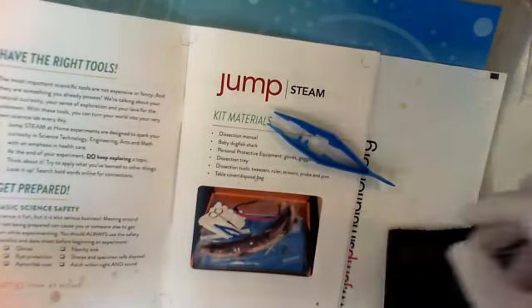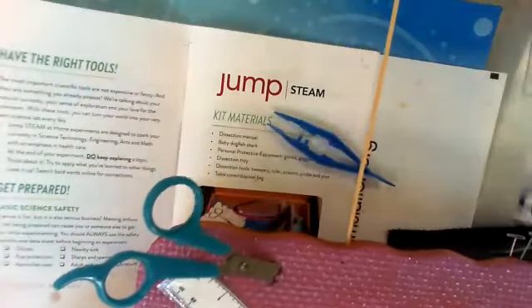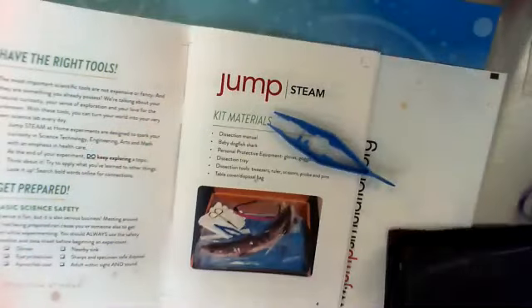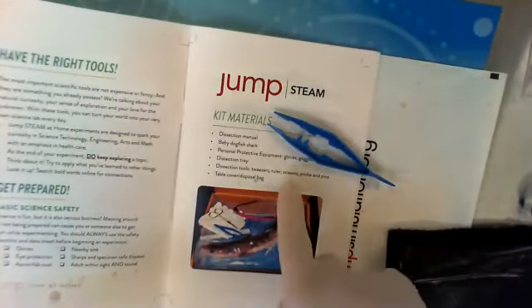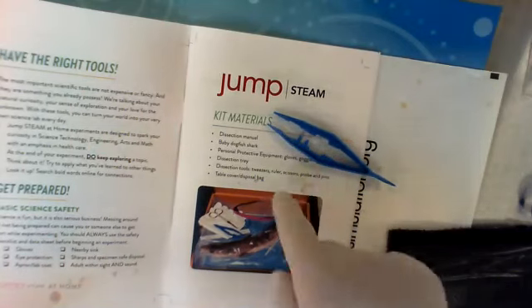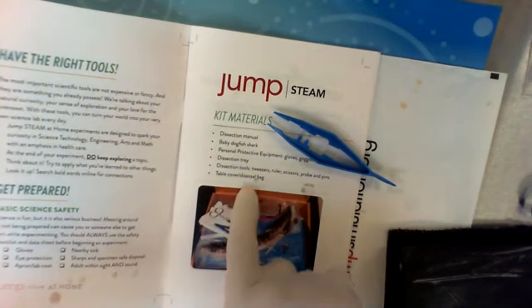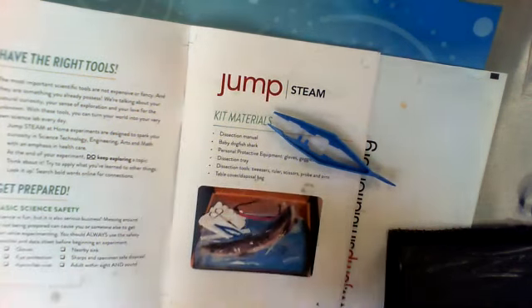Ruler, scissors, which we just saw. There are all kinds of different scissors. I prefer the rounded tip. These are actually not the rounded tip. I'm using the leftovers from what we've done before, so unfortunately. Probe, which is the wood stick, and then pins, right? You have a table cover, which is also your disposable bag, and that's what we're going to use now.